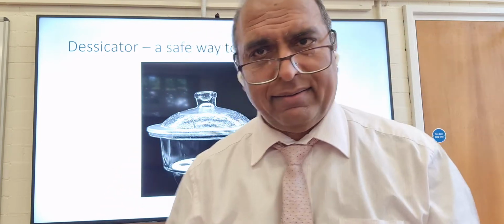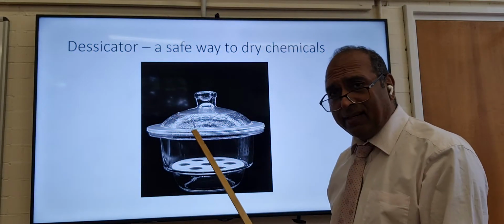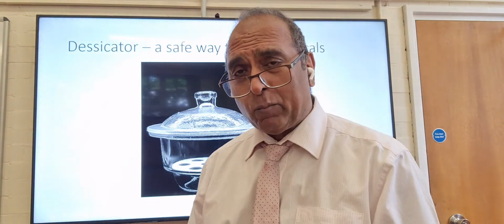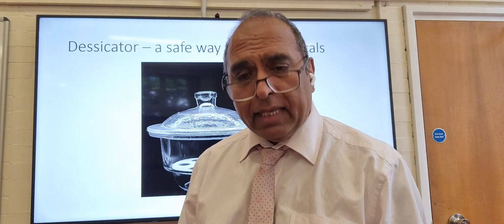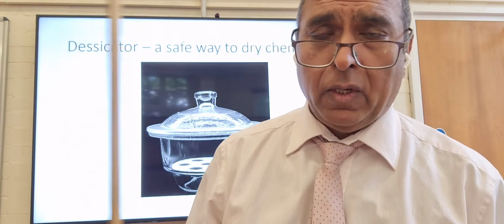But look, in science, you'd use a desiccator. You wouldn't be dabbing with filter paper. You might dab with filter paper if you don't have a desiccator. That's why the exam boards allow it. Not all schools have got desiccators.